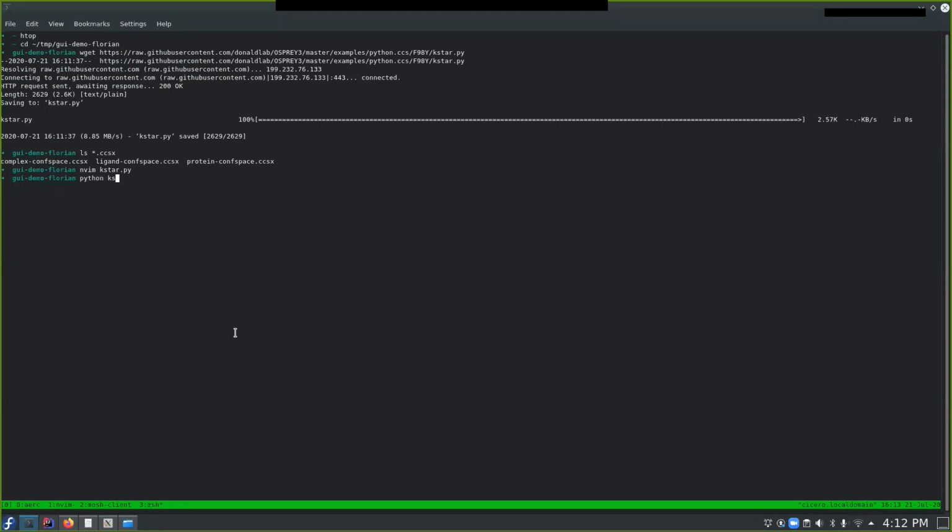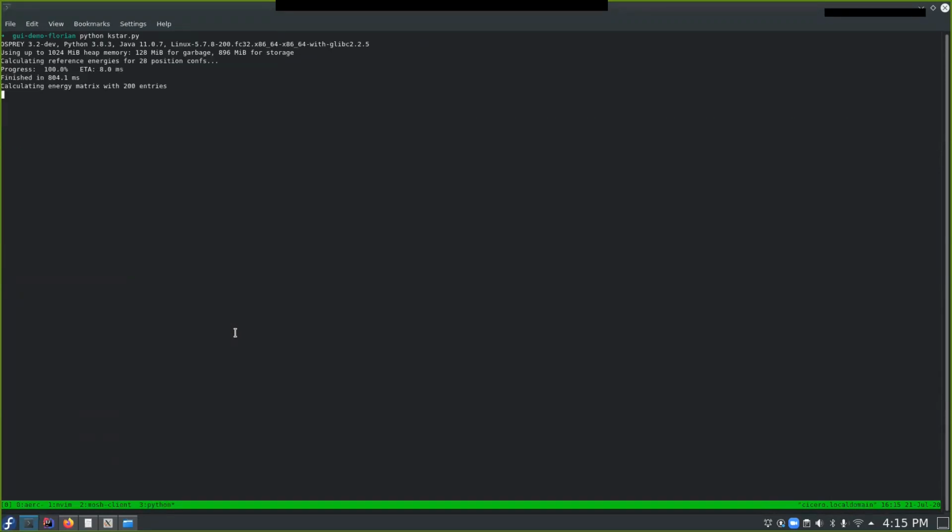So let me see. We now use Python and we can just run the kstar.py example. And so this is going to take some time. So I'm going to go ahead and pause it, and I will come back when it is complete.